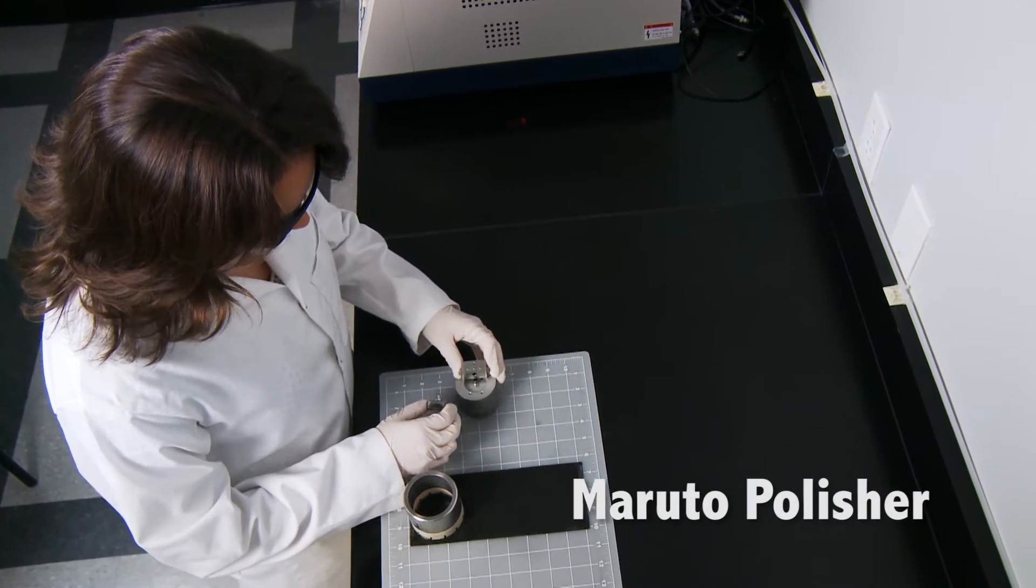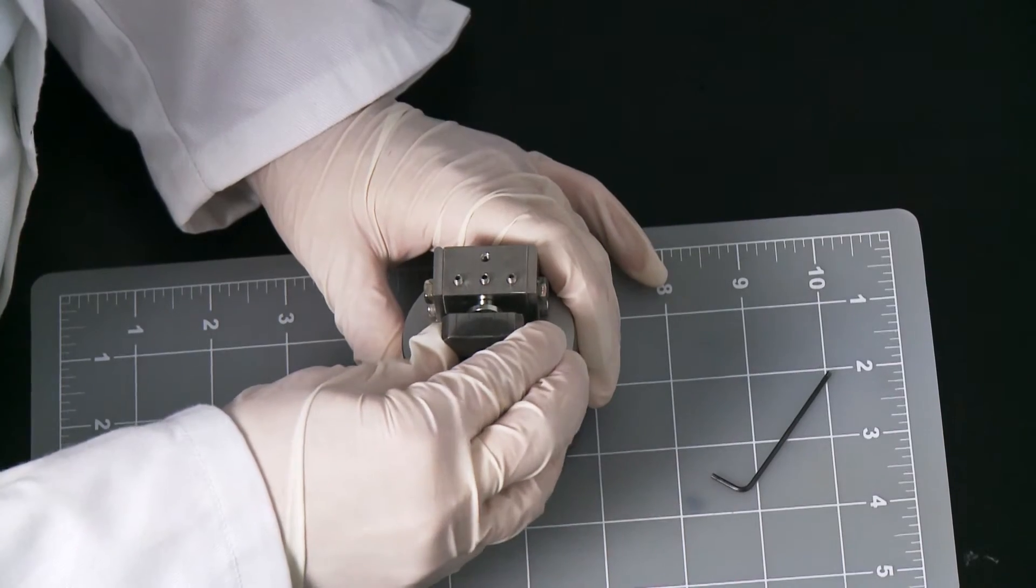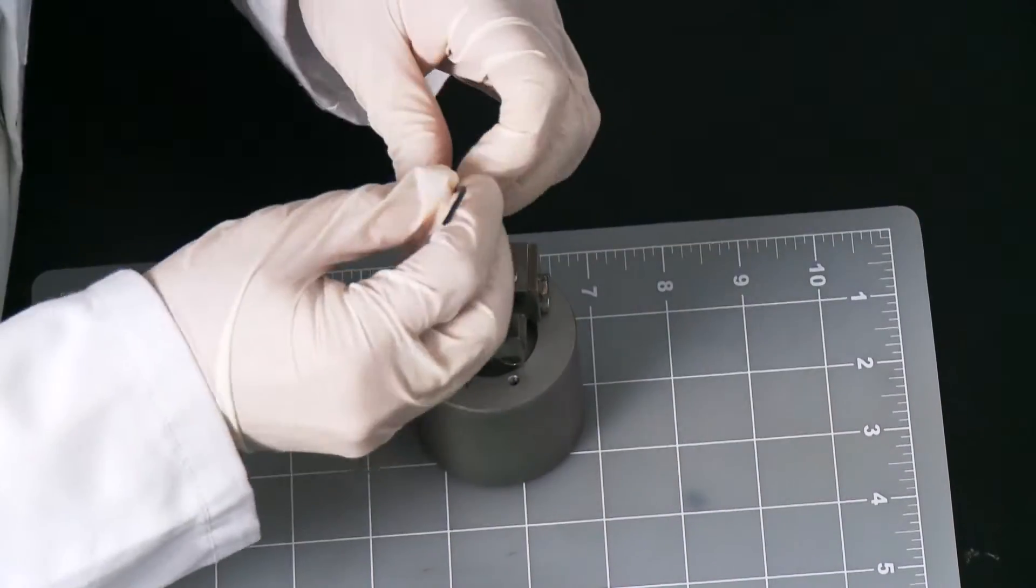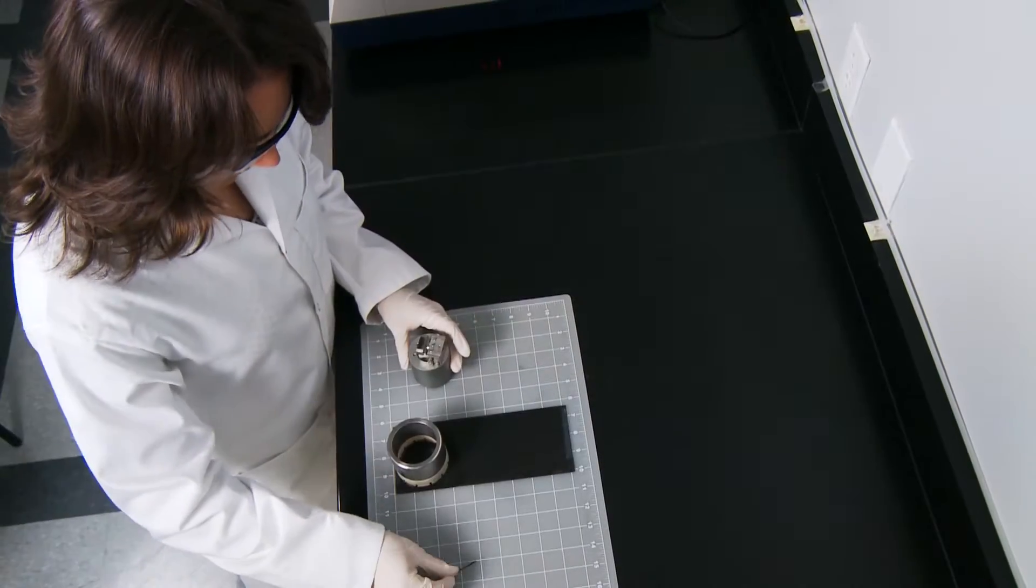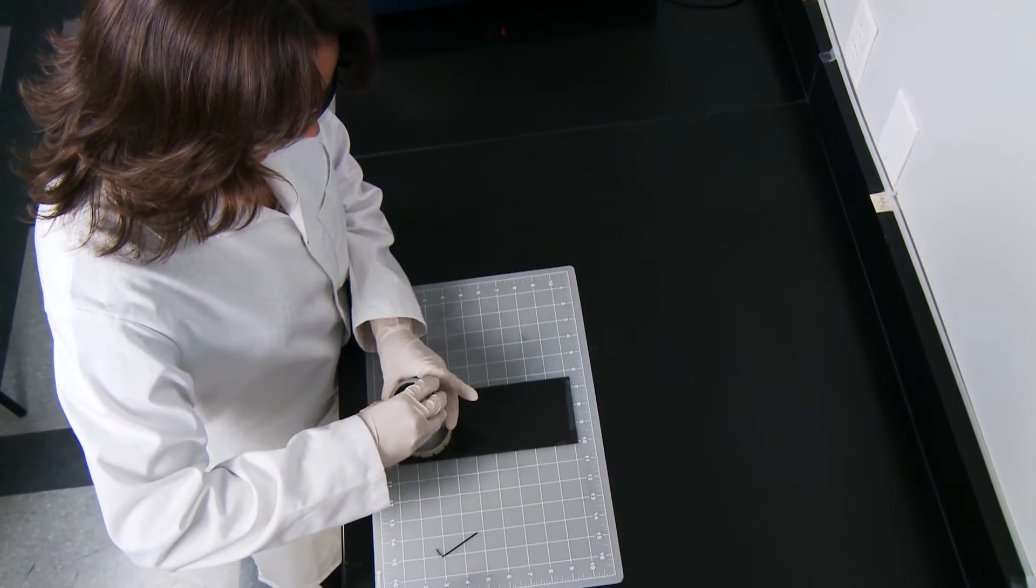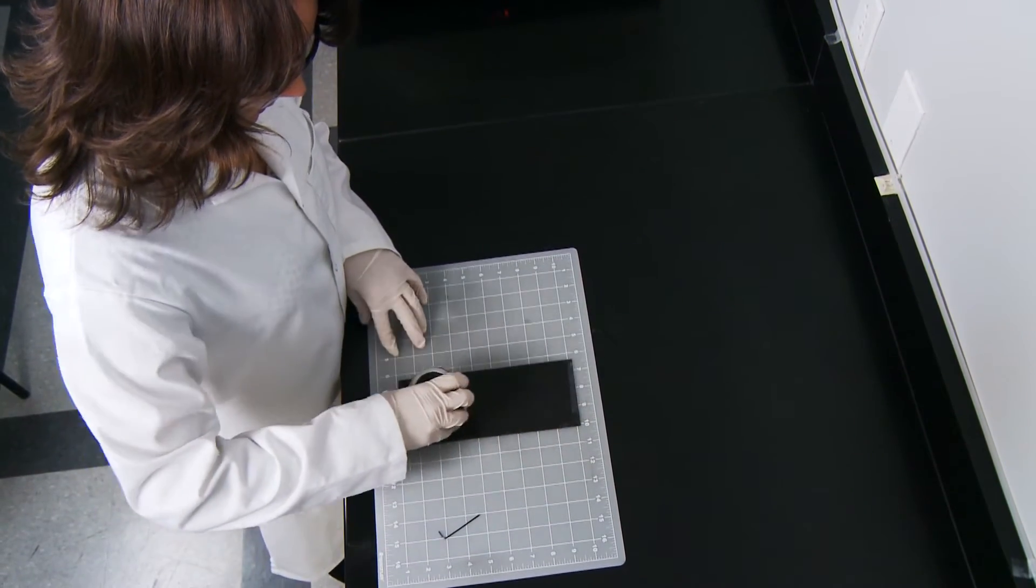The Maruto polisher is just as useful and easily provides a controlled method of polishing which can be used for organic and soft materials as well as end pointing. The Maruto polishing set can effectively be used for removal of composite materials of varying densities without fear of severe relief effects commonly seen with other mechanical polishing techniques.